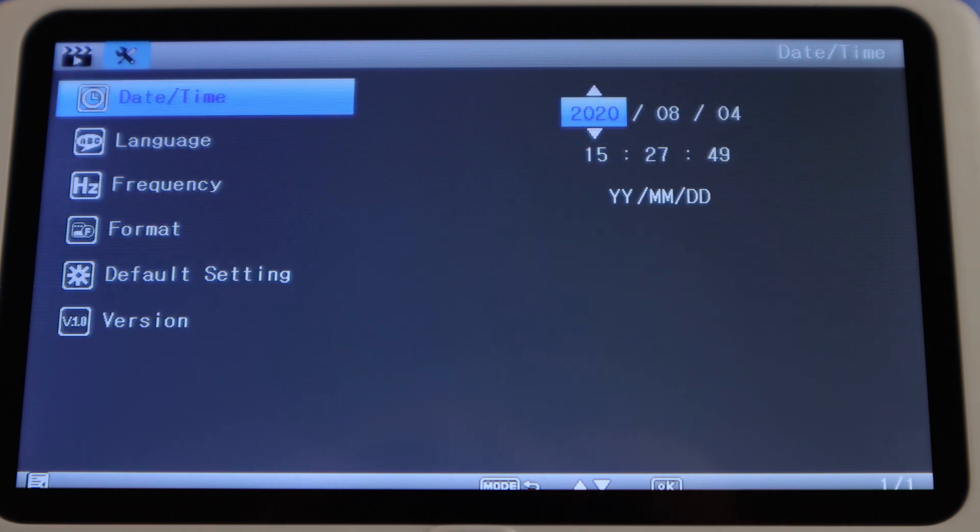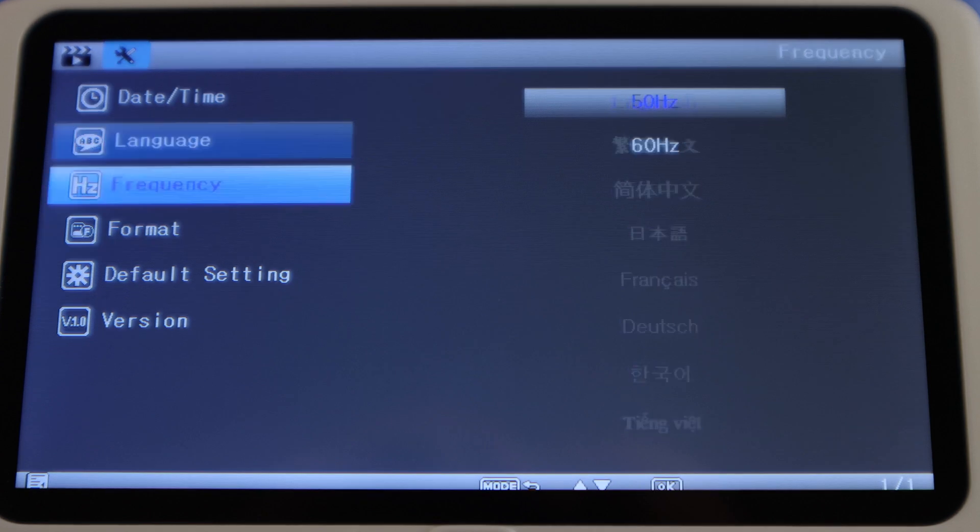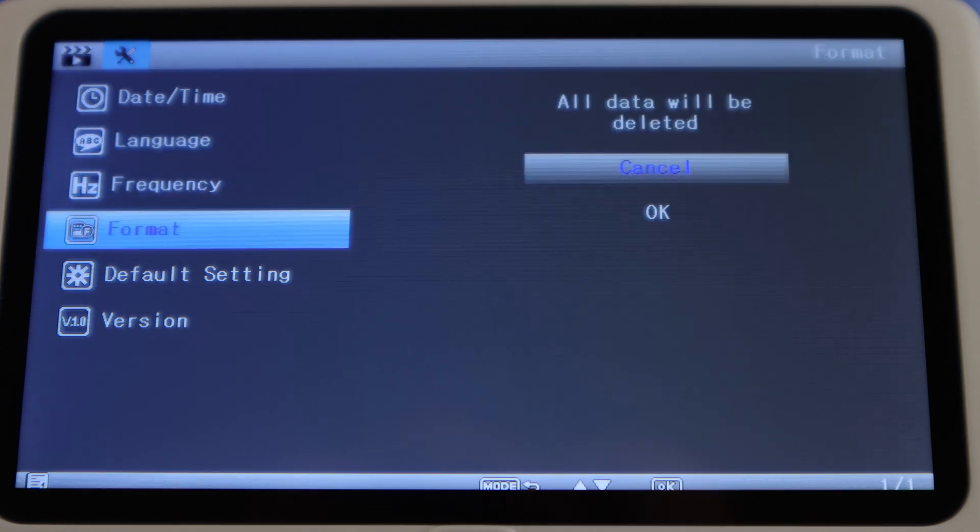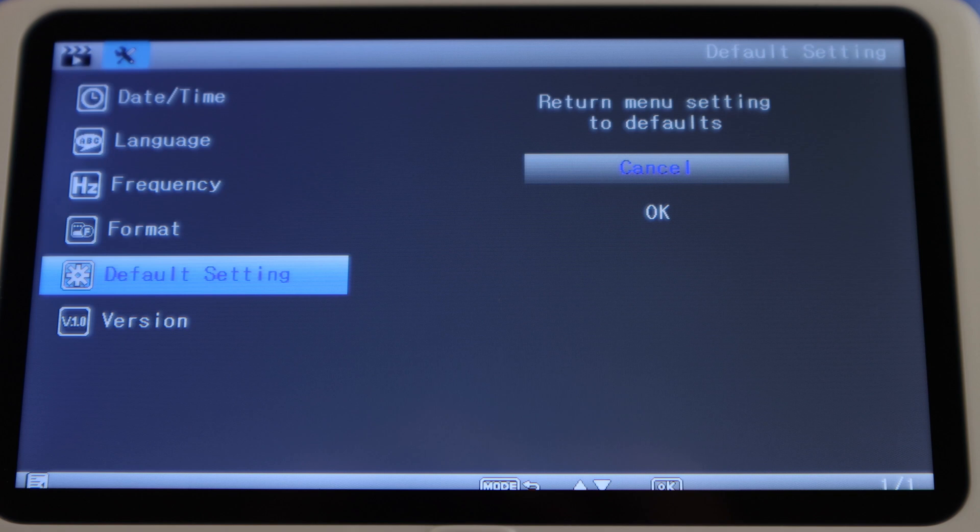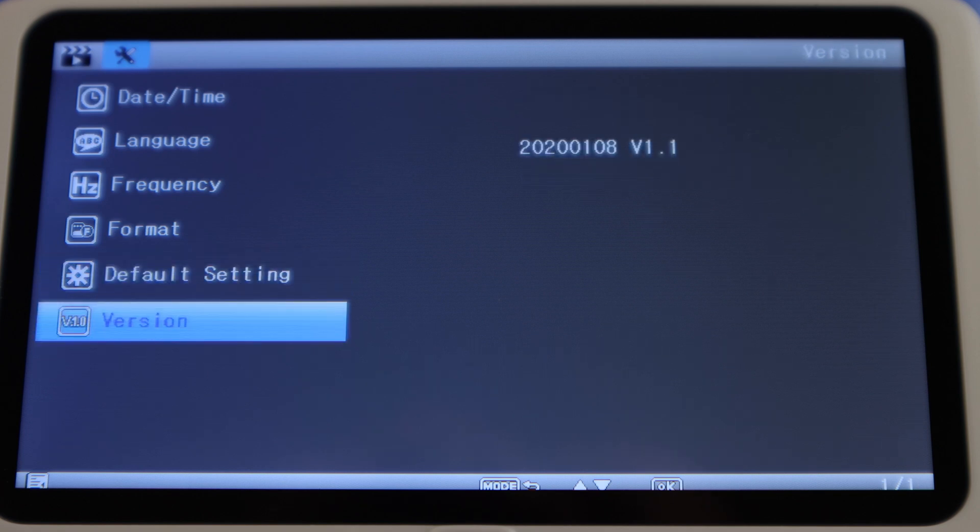In the general settings, you can set the date and time, language, display frequency, format the SD card, reset the microscope to default settings, and check its firmware version.